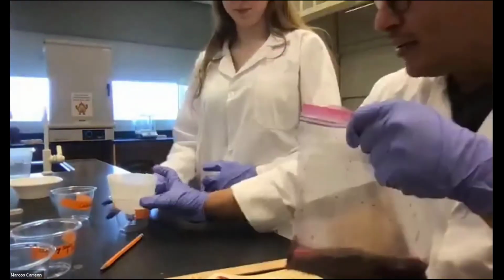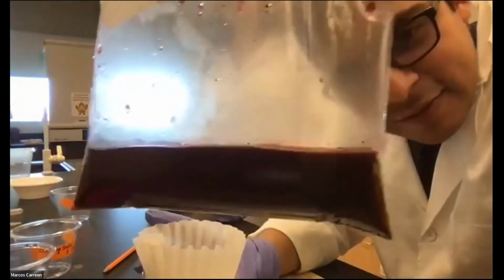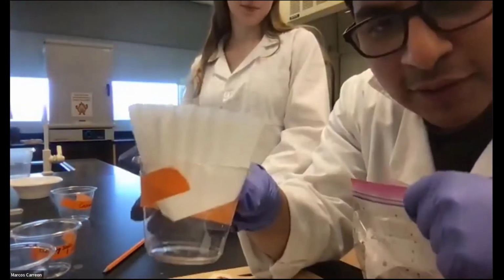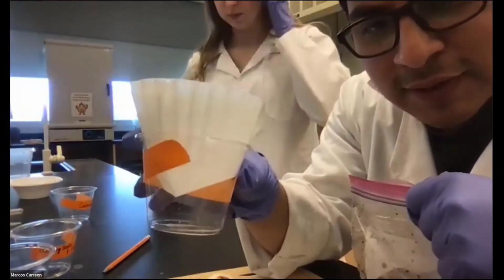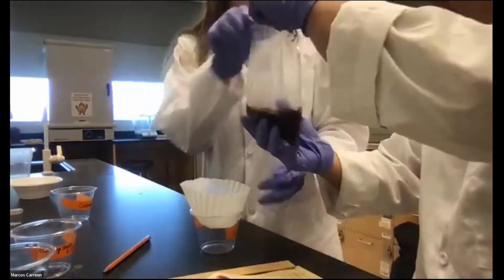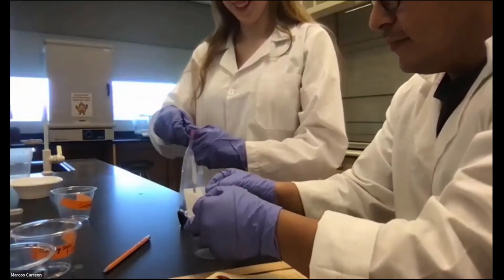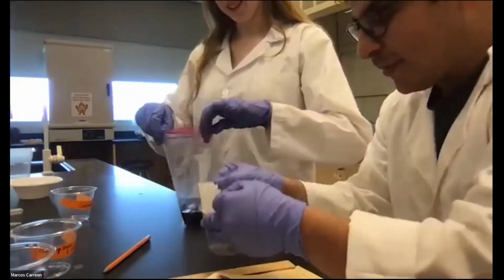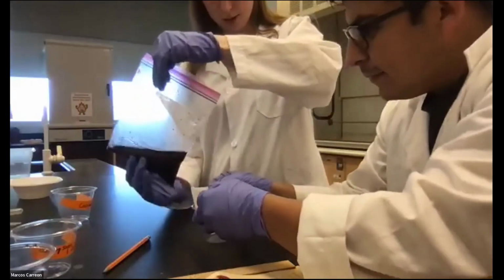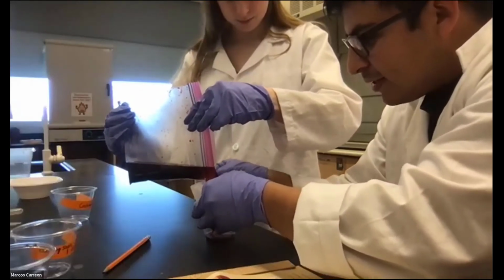So what we're gonna do now is, since there's still bodies of the insect of the cochineal bug in there, we're gonna use a coffee filter to filter those bugs out from the solution. So we're gonna go ahead and do that now. Do you want to pour that in there, or do you want me to hold this? I'm gonna hold this for her, and she's gonna pour down the solution, the bugs in there. You can do it slow, fast.